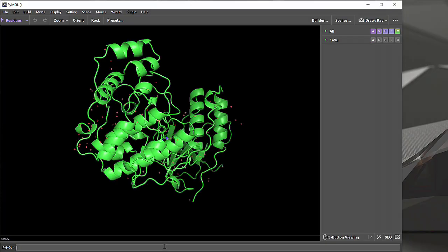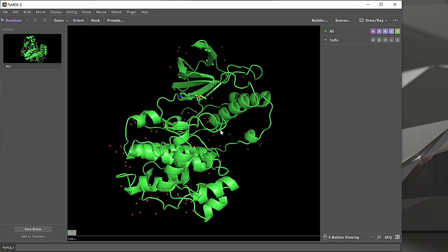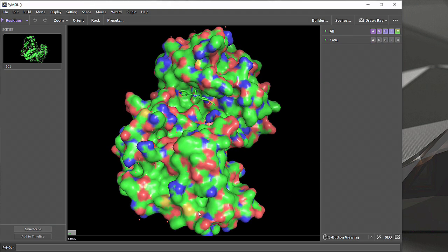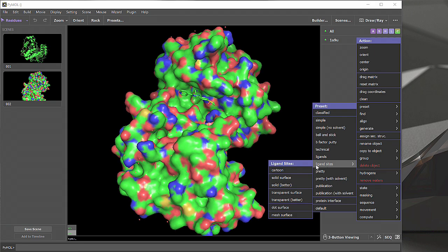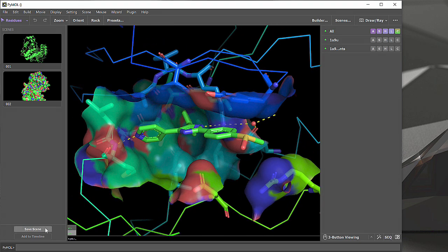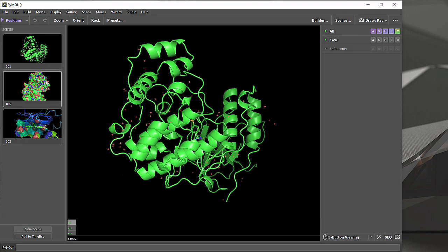Here, we start with a protein with the cartoon ribbons zoomed out. We simply click the Save Scene button to save this as Scene 1. Suppose then we add a surface and save this as Scene 2. And suppose now we apply a more advanced preset. And save this as a scene. Now, simply clicking the thumbnails on the left, we can navigate easily to each scene.